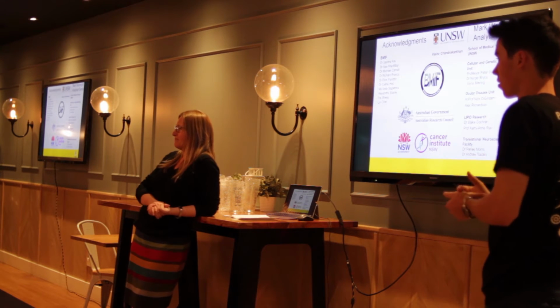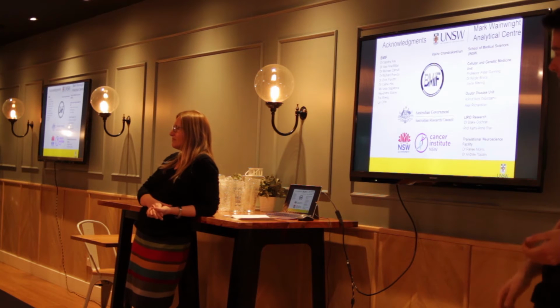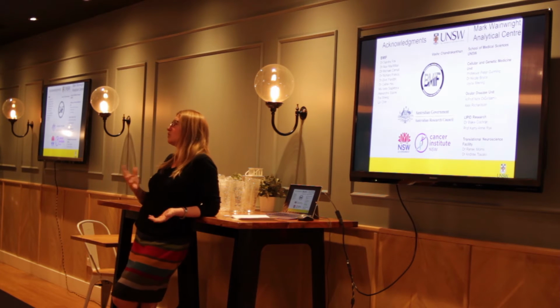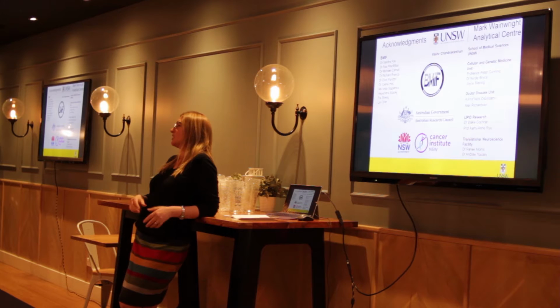Yes. You said you don't use JPEG, so I'm guessing you don't use bitmaps either. What sort of file formats are these images stored in? They're either a proprietary format that comes from the vendor, but the universal format that we all use is TIFF.